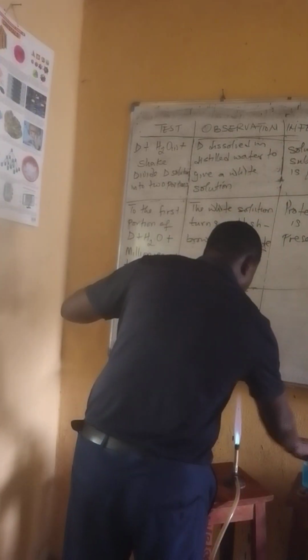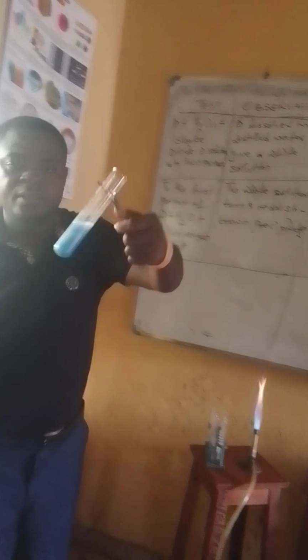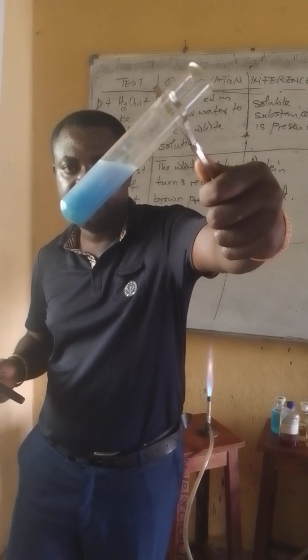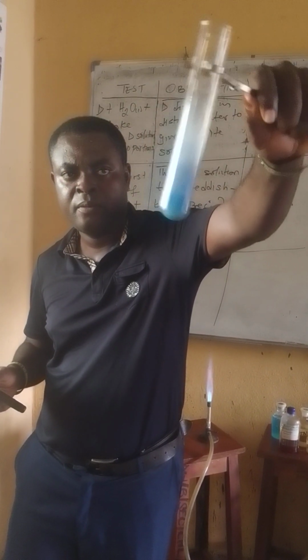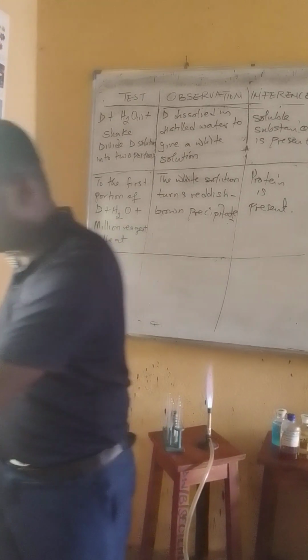The solution turns blue. Already it has turned violet. We don't even need to heat it. This is violet color. Can you see? Let me do it again.